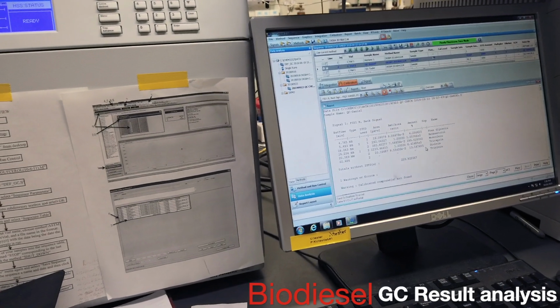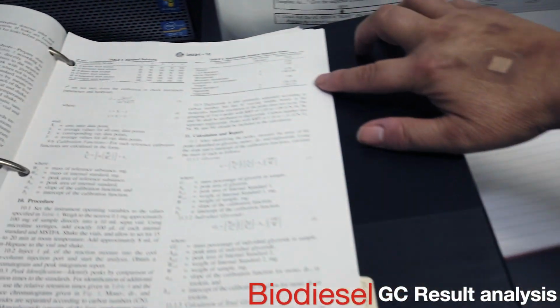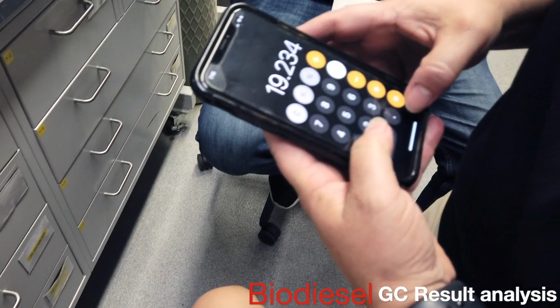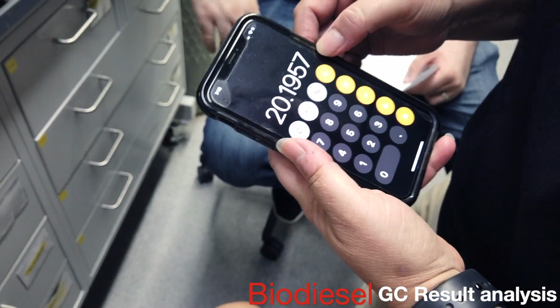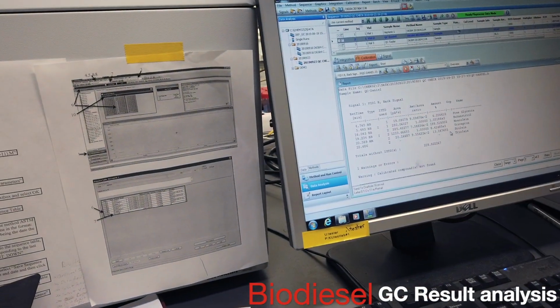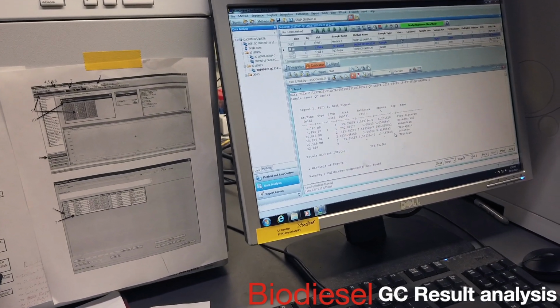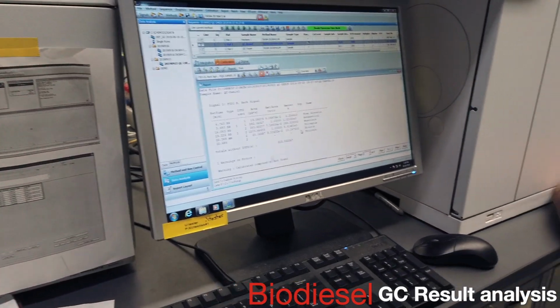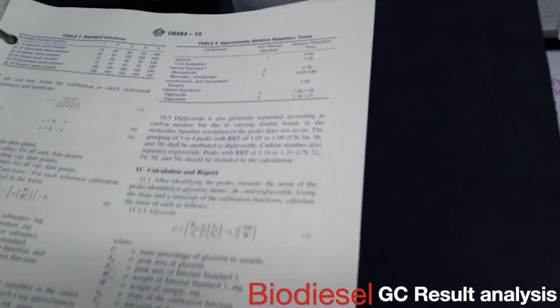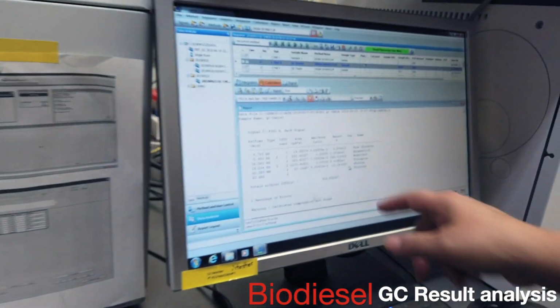and that's going to be my mono-oleins. Now they say, if my tricapran is 19.234, for my diglycerides it's 1.05 to 1.09. So I would take that times 1.05, and I get 20.19. So my diglycerides are going to be in the 20 range. So I go from like 19 something to like 21 something. And then same thing I would do with the triglycerides, 19.234 times about 1.16, so somewhere around 22. And that's where triolein was. Okay.